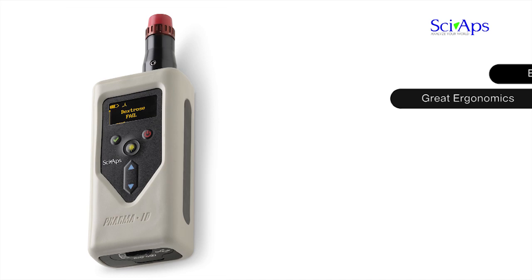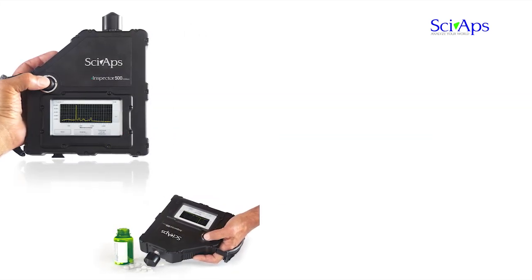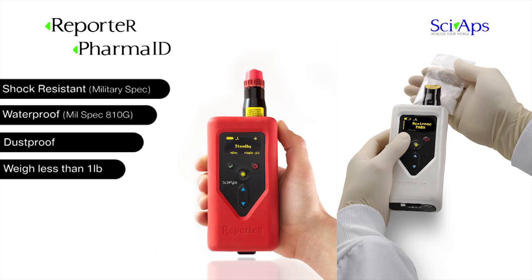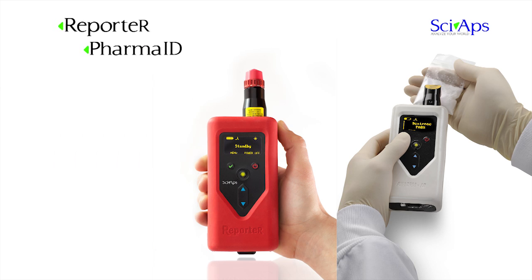All of our Raman analyzers are designed for easy one-handed operation with excellent ergonomics. The Reporter and PharmaID products are truly a single-handed operation. Not much larger than a smartphone, they weigh less than one pound, are waterproof, dustproof, and meet demanding military specs for shock resistance, including mil-spec 810G.